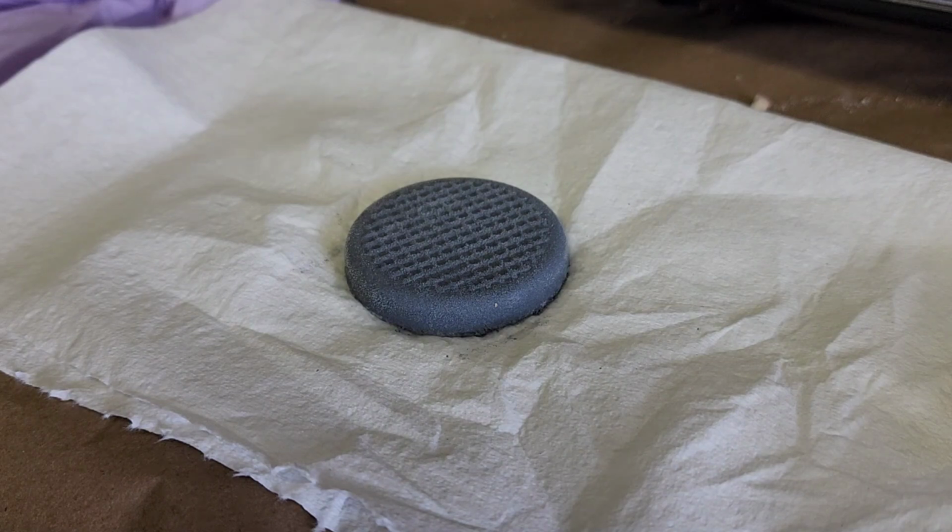And I may still change up the formula a little bit to make it a little more stout, but I think this is promising. So I'm going to be sintering these after debind. I might do a few more experiments with the other two test pieces that I had, but hope to report out pretty soon on results and go into the process a little bit more.